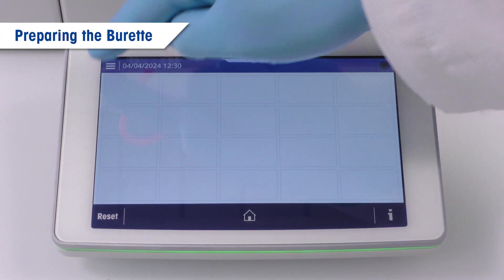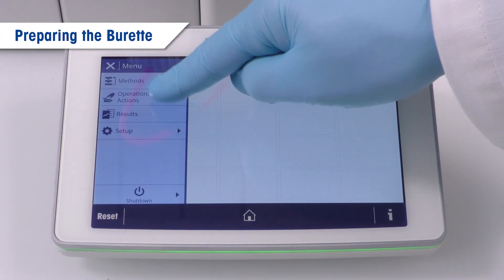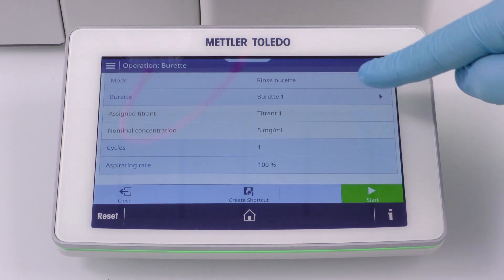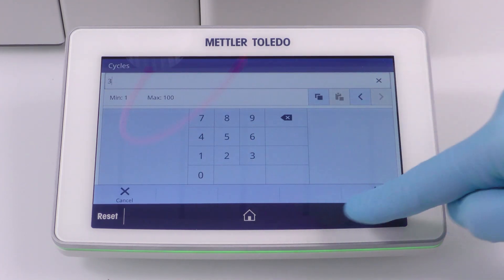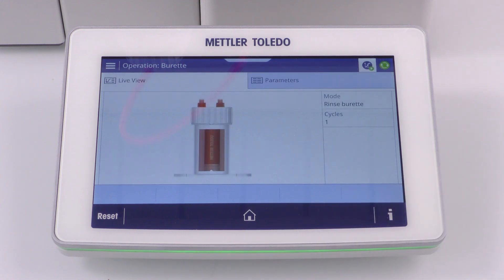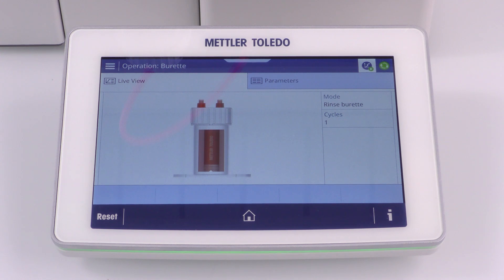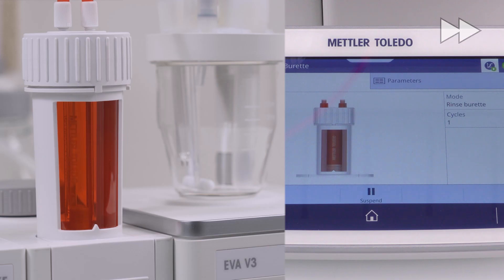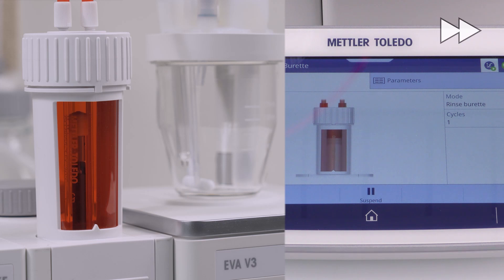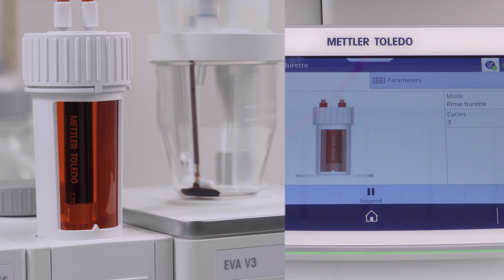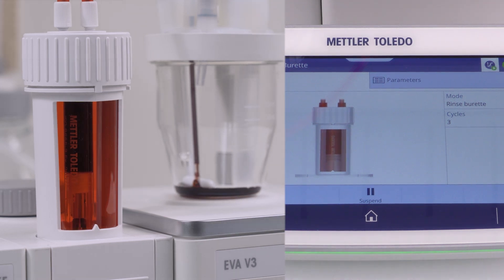After finishing the resource setup, we need to fill our burette with KF titrant. Under operation, action, burette, you will find the option to rinse the burette. Choose three cycles and stop it manually when the titrant flows out of the tube into the cell. Make sure that there are no air bubbles in the burette or the tubes. If there are, fasten the tubes more tightly and rinse the bubbles out.